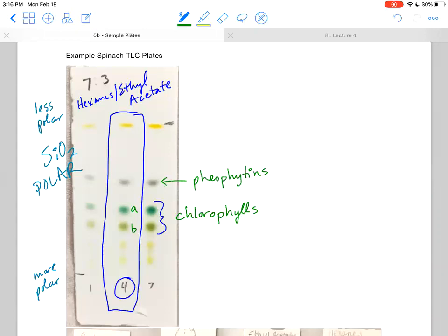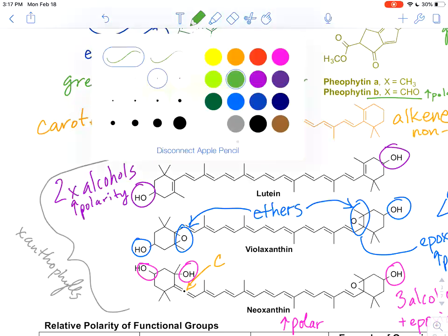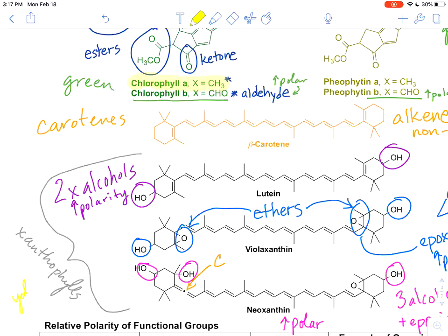Let's go back to our list of molecules to see who's left. And here's who we have left. The carotenes, namely beta carotene, is going to be bright orange. And then the xanthophylls, the ones there on the bottom, these are going to be yellow. Can you even see that? Yeah, sure. So let's go back and look for the carotenes first.